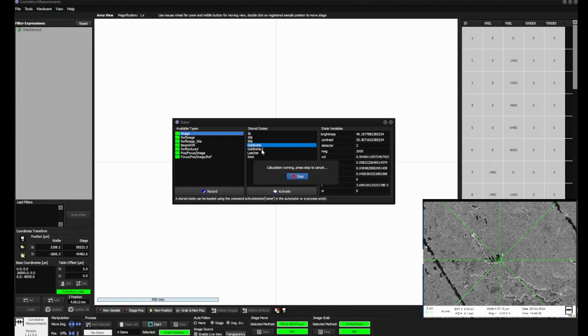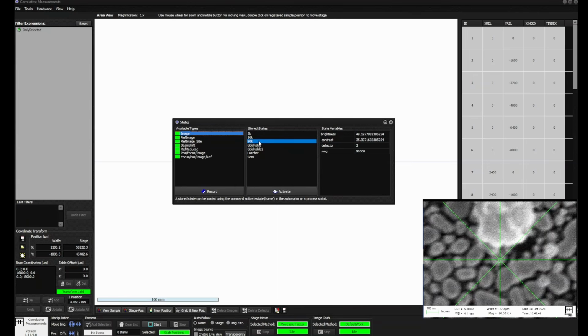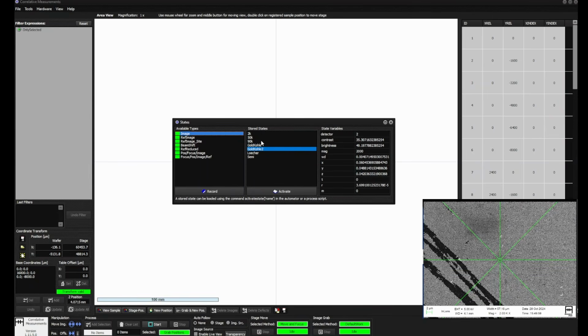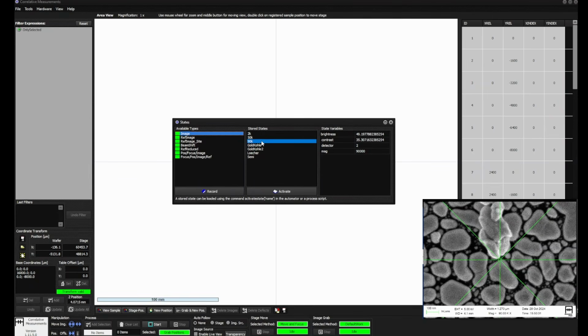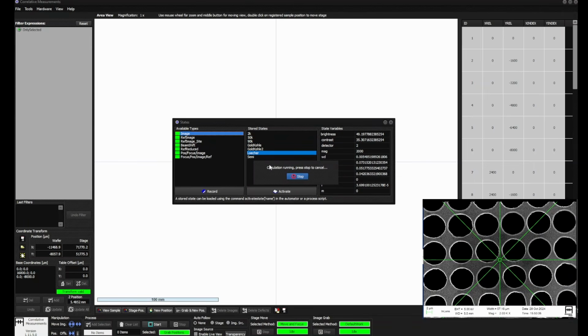It's a special point on the gold carbon surface, and we have this thing there, and then we have another position on the gold carbon surface, and when we zoom in, then we have this thing there.